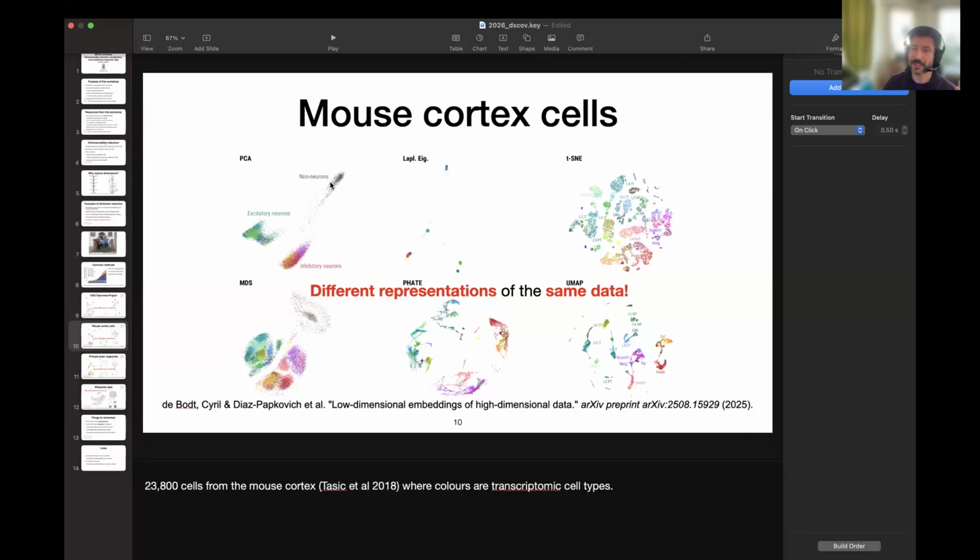So there's a difference that is measurable in the transcriptome here. Whereas in the UMAP or TSNE data, the distances between, say, the far side here and the far side here, these are not interpretable in any way. But you do see these clusters in a much finer scale that makes it really, really useful when you want to think about, like, is there a specific cell subtype? So that's where the strengths of these methods come in.